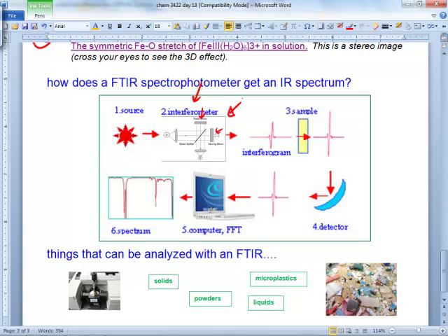But actually, that's why in the machine it says, please don't move me. There's moving parts, because if you slide it, and I did that once, I forgot, and I heard the mirror go dung, right? Because it's sliding back and forth there.